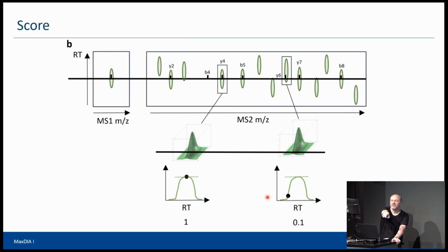There's a question over there. How many MS2 scans minimum do you recommend to get the trace data point of the detection? Yeah, surprisingly, this can be very little. It makes a huge difference if you allow for single scan peaks or not. In the beginning, we were thinking one should probably be a bit strict with the number of data points for the elution of a peak, right? Because in old school, people would say this has to be seen in at least 6 scans or something like this, otherwise it's not good. But that's actually not the case.